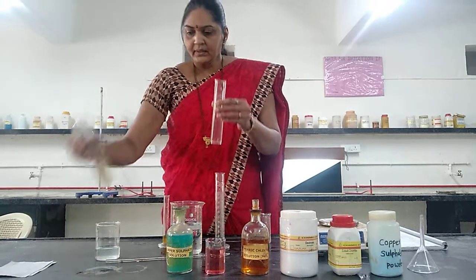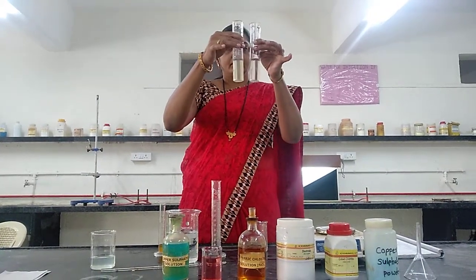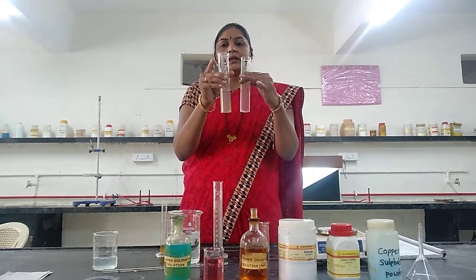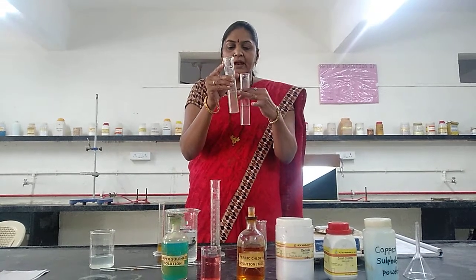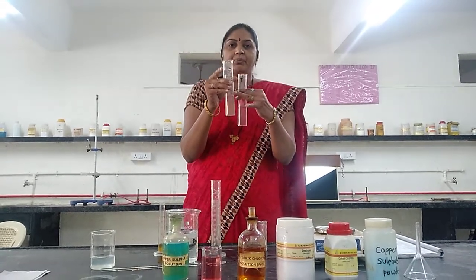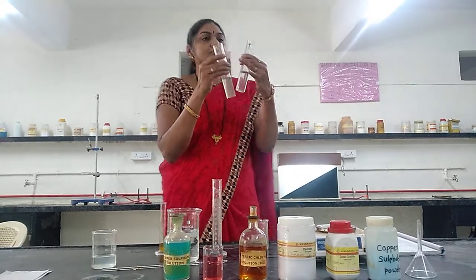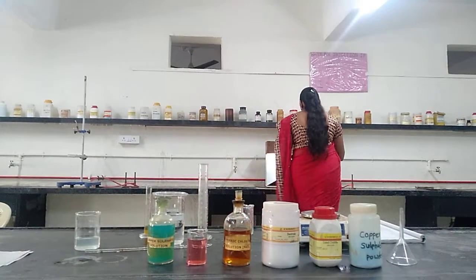Both of these are observed, both are the same. This is test 1, that is dextrose along with water. This is the standard solution, in which ferric chloride, cobalt chloride and copper sulfate are mixed, and both of these are observed under dark and white background.